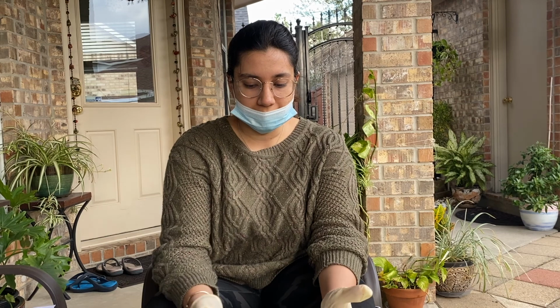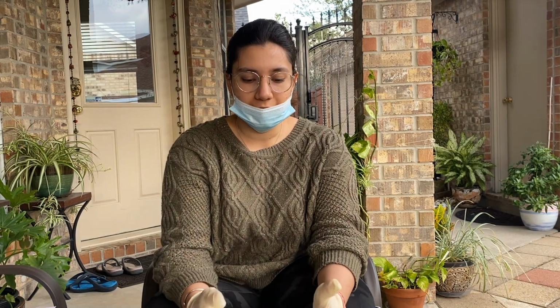So that's the end of my brain dissection video where I dissected and identified, I believe, a little bit over 20 structures. So thank you so much for watching.